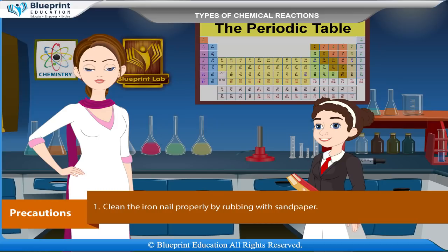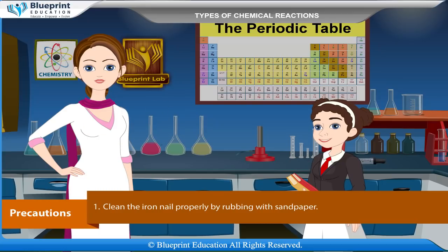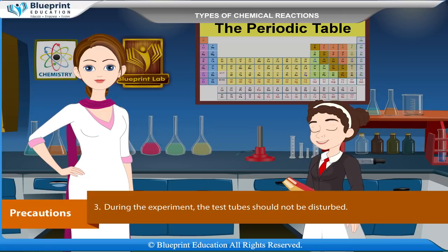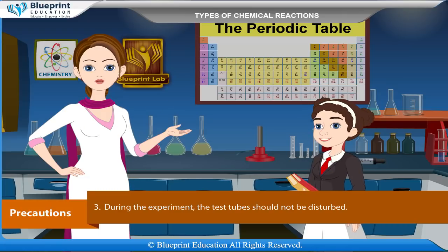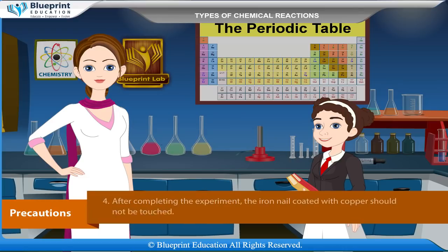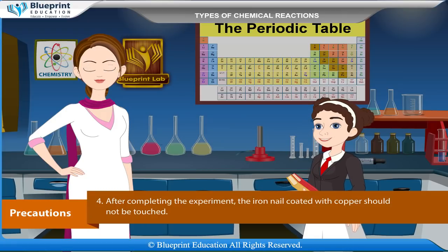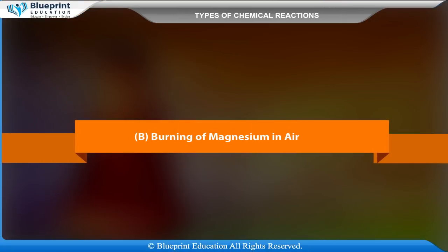Precautions: Clean the iron nail properly by rubbing with sandpaper. Copper sulphate solution is poisonous, so handle it with care. During the experiment the test tubes should not be disturbed. After completing the experiment, the iron nail coated with copper should not be touched.